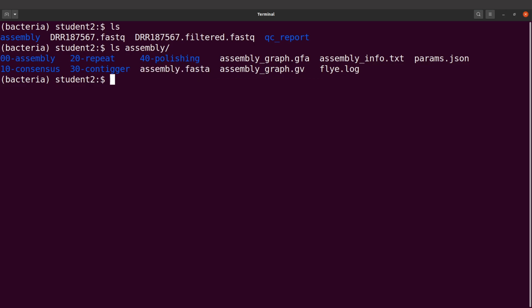All right, so to run QUAST, if you installed using Mamba, then it has to be this way: QUAST, and then you supply it with the options, including your input file. There are other ways that can be used to install QUAST, and those ones require that when running QUAST, you say QUAST.py. So you need to know how you installed it, and you can use the appropriate command. All right, I installed using Mamba, so I'll use the first approach I indicated.